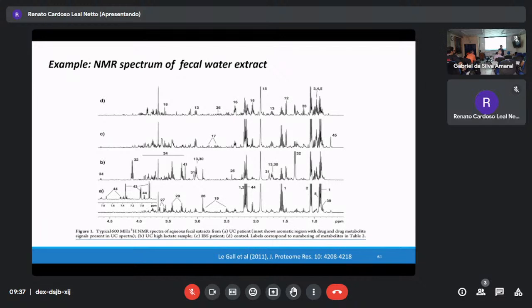First, I will divide it. Are you interested in protein? But I'm a metabolomist. I'm not interested in protein. Okay. Then how to remove the protein? That's the issue, right? First I will centrifuge. Then this will take up. But before that, maybe I can add some organic solvent like for a blood sample.